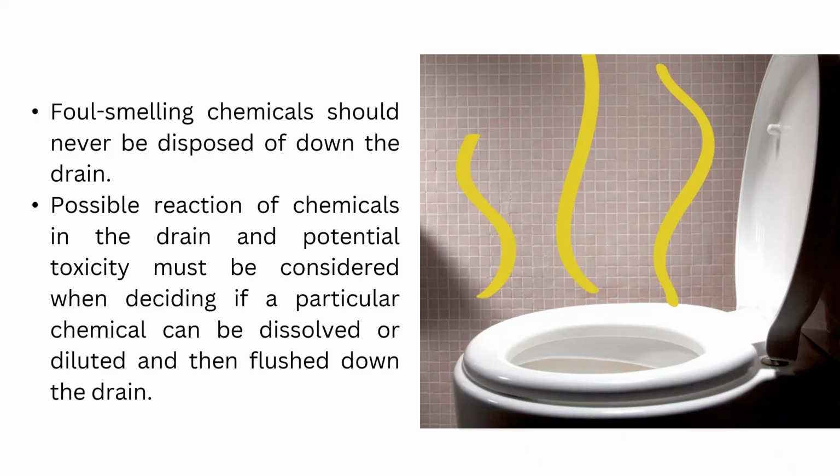For example, sodium azide. Sodium azide is used as a preservative, but this forms explosive salts with metals such as the copper in our pipes. Many institutions ban the use of sodium azide due to this hazard.